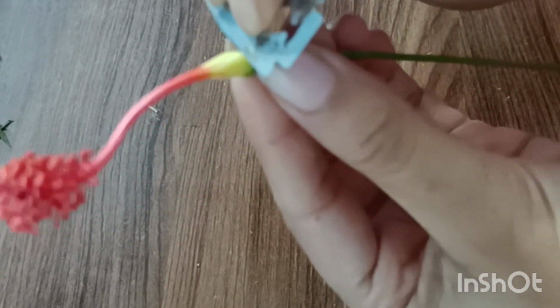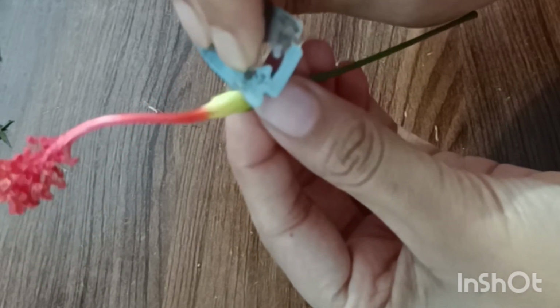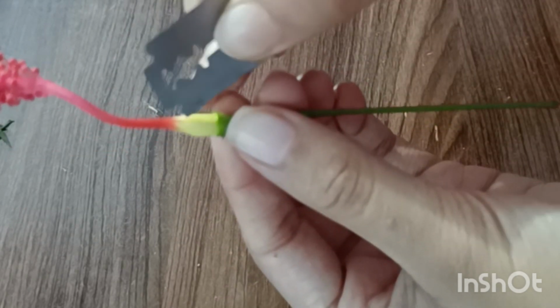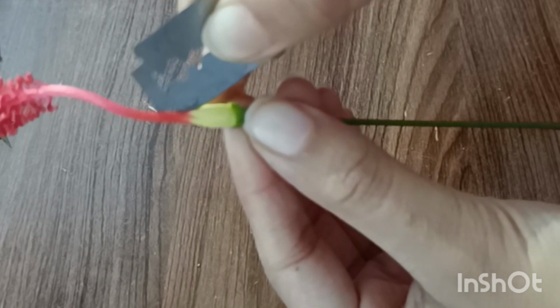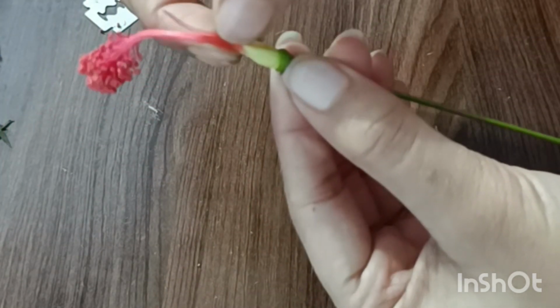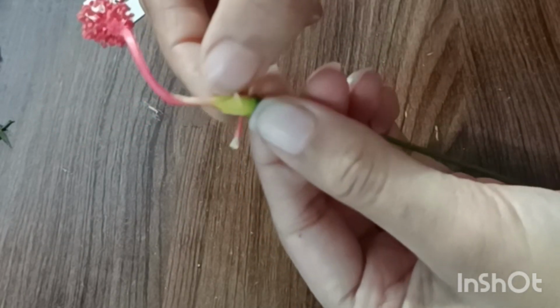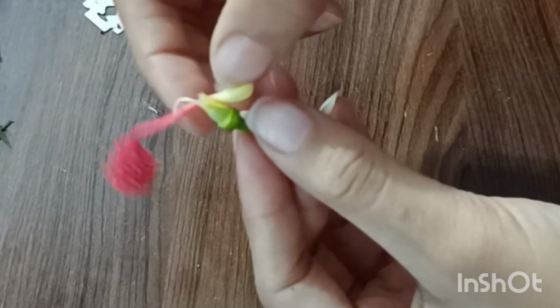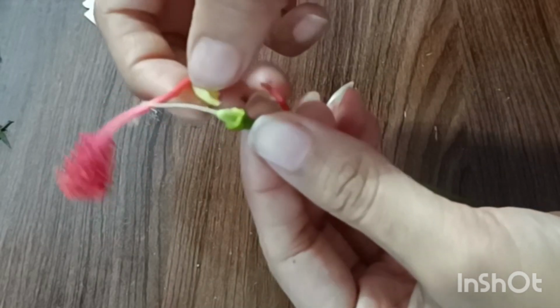Now, I observe the gynoecium present inside the staminal tube. It is pentacarpellary, the ovary is superior, and the ovary is pentalocular. Each locule contains many ovules. The style passes through the staminal tube. The stigma is 5-lobed.